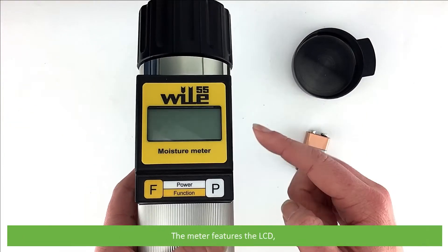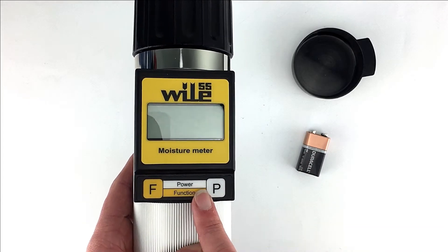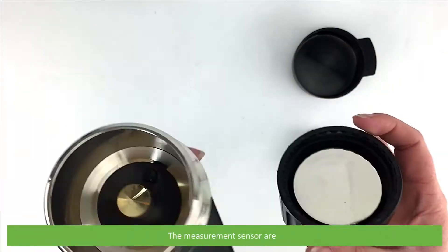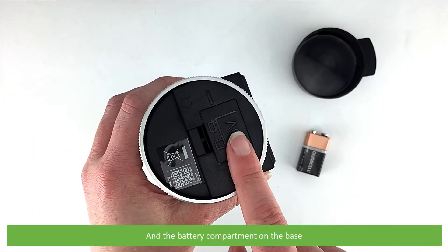The meter features an LCD and two buttons below, which are Function and Power. On the top is a measuring sensor lid and the measurement sensor area, and the battery compartment is located on the base.